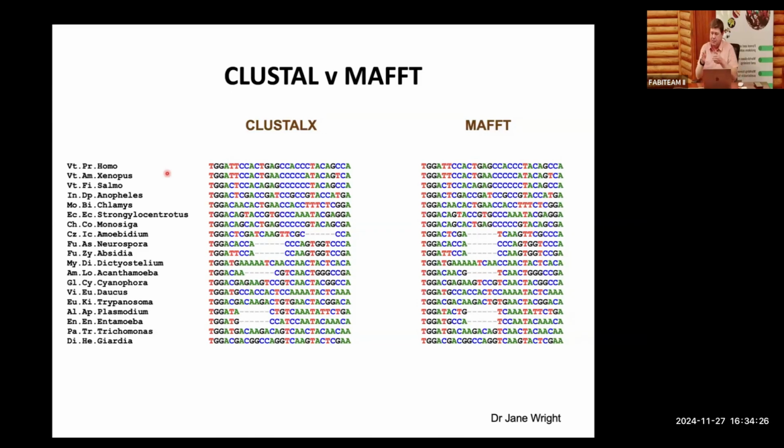So when you have sequence segments or nucleotides that are like microsats, not duplicated, but in tandem, so you have repetition of sequences, then it's very difficult for this program to decide where it should be placed. So if you have TA, TA, TA, TA, and in say 6 TAs in the second sequence, only 5 of these repeat units, then it can put a TA on this side, can put a TA on this side, break it up, so that becomes a problem.